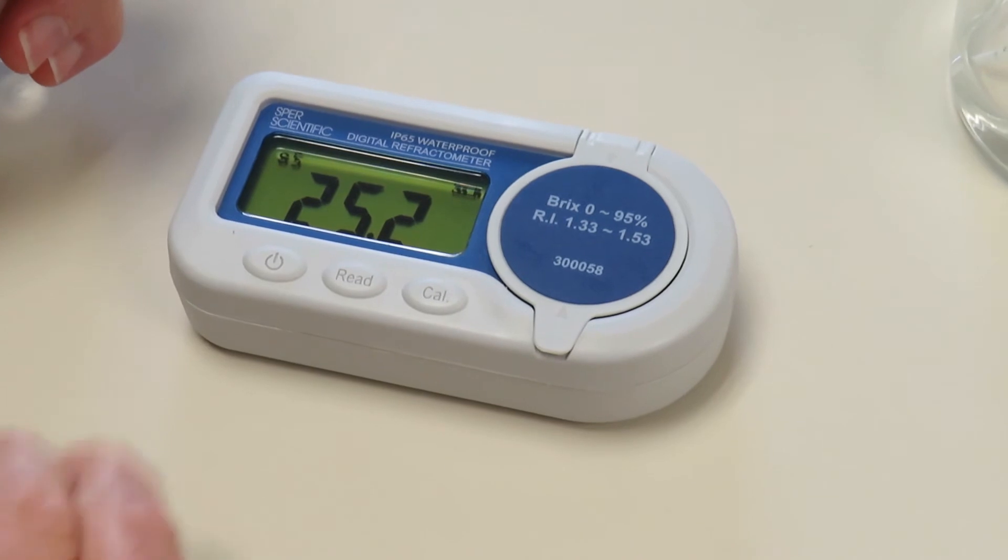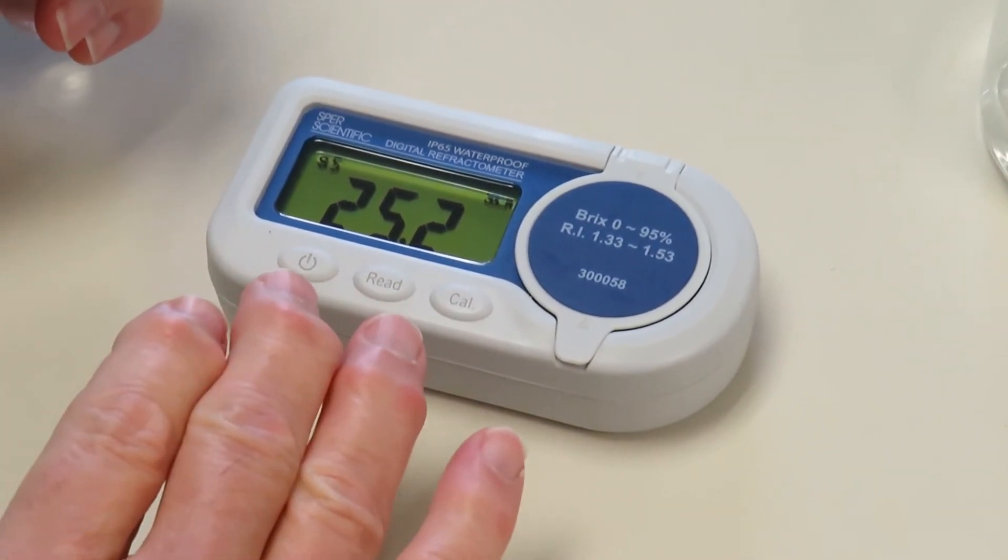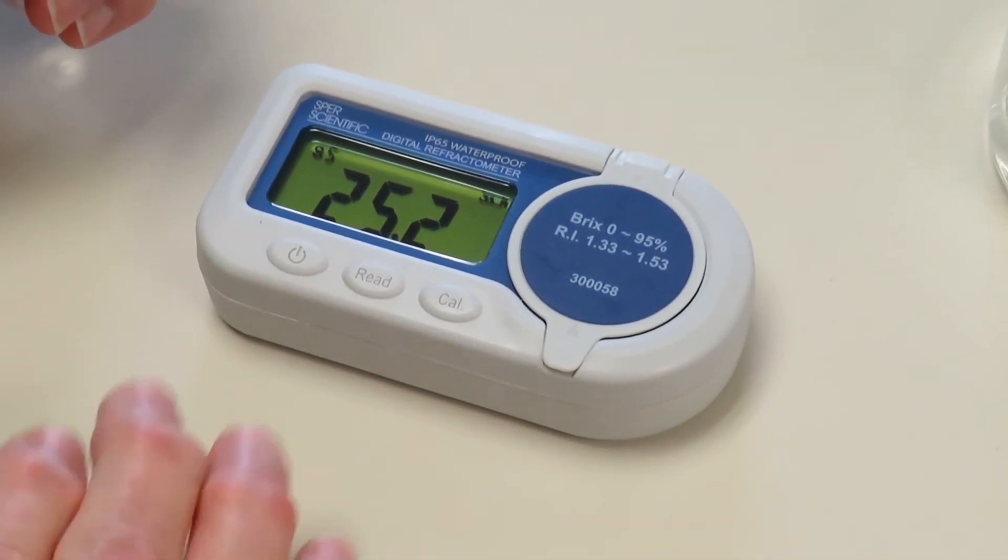And this is a 25.2 BRIX reading. In other words, there is 25.2% sugar in this solution. And that's it.